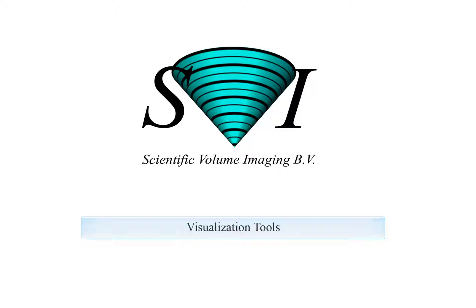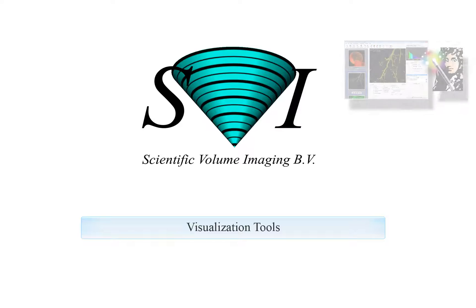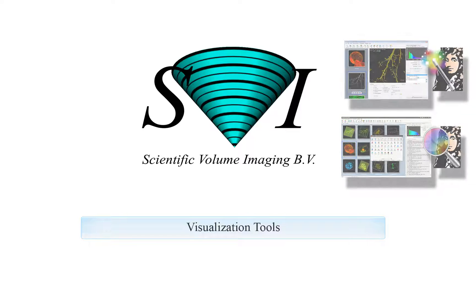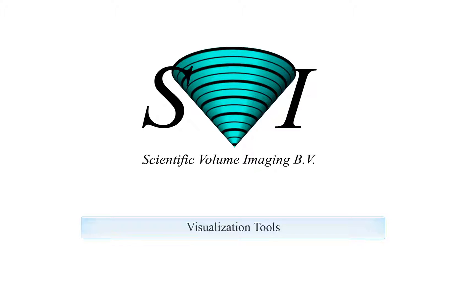Welcome to this tutorial on the visualization tools in Huygens. These tools are available for Huygens Essential and Professional. With the visualization tools in Huygens you can visualize and analyze your image in detail.